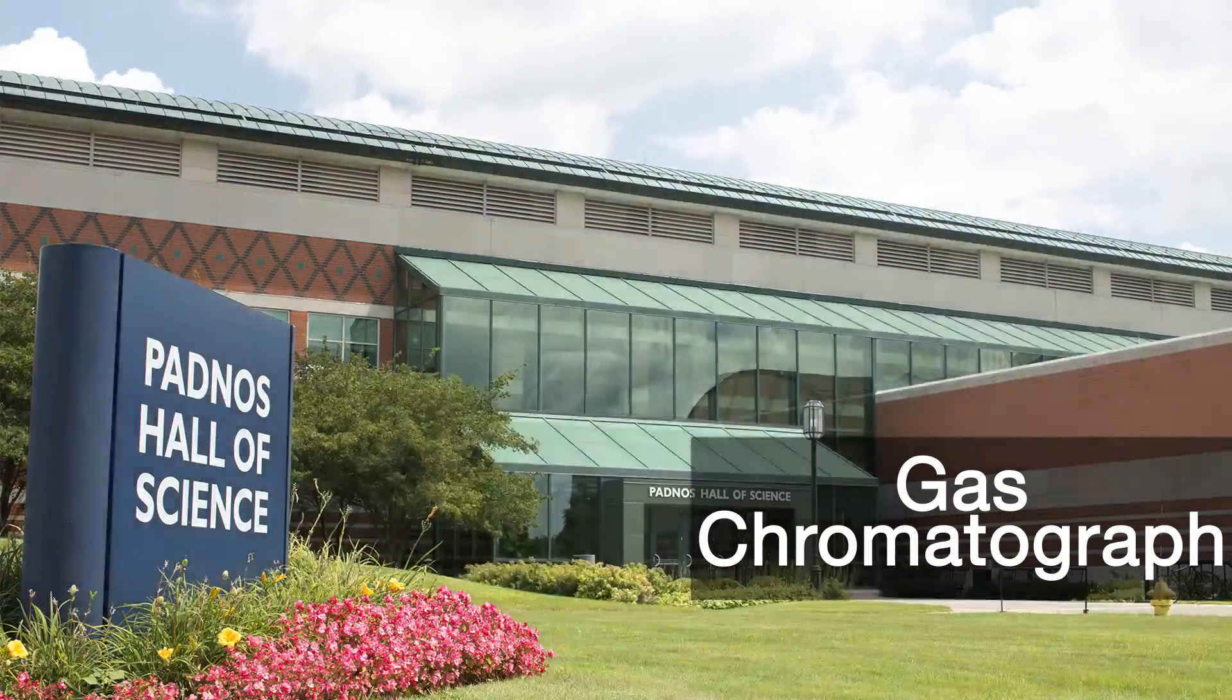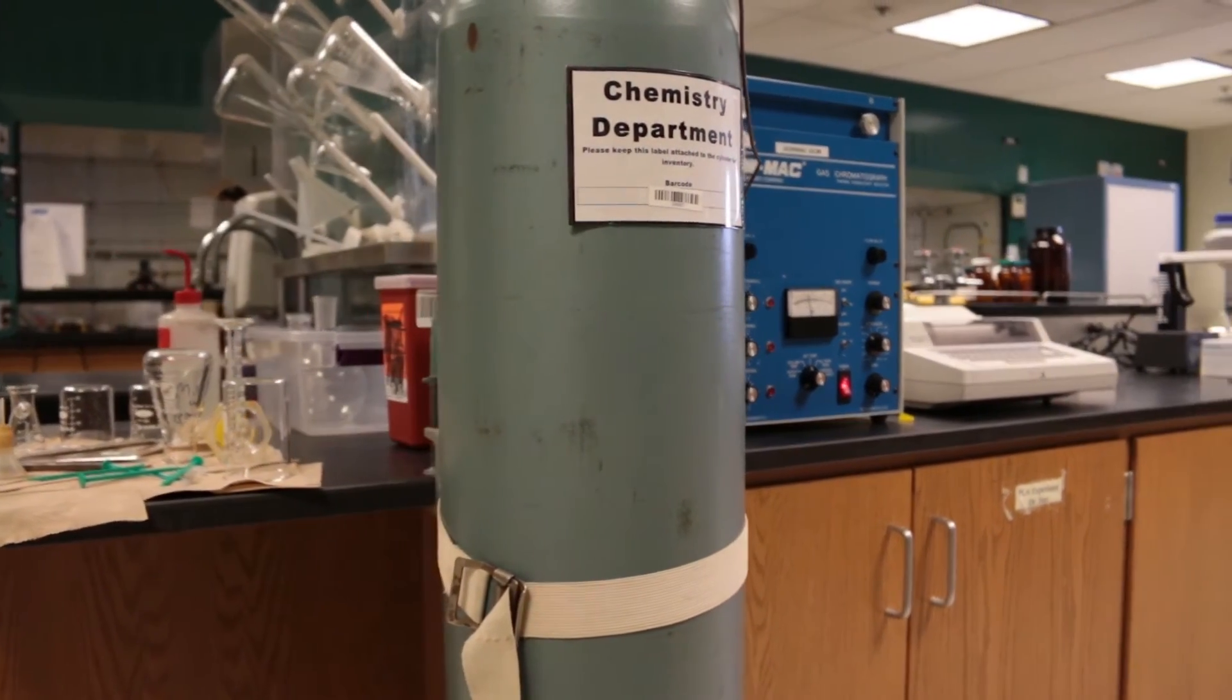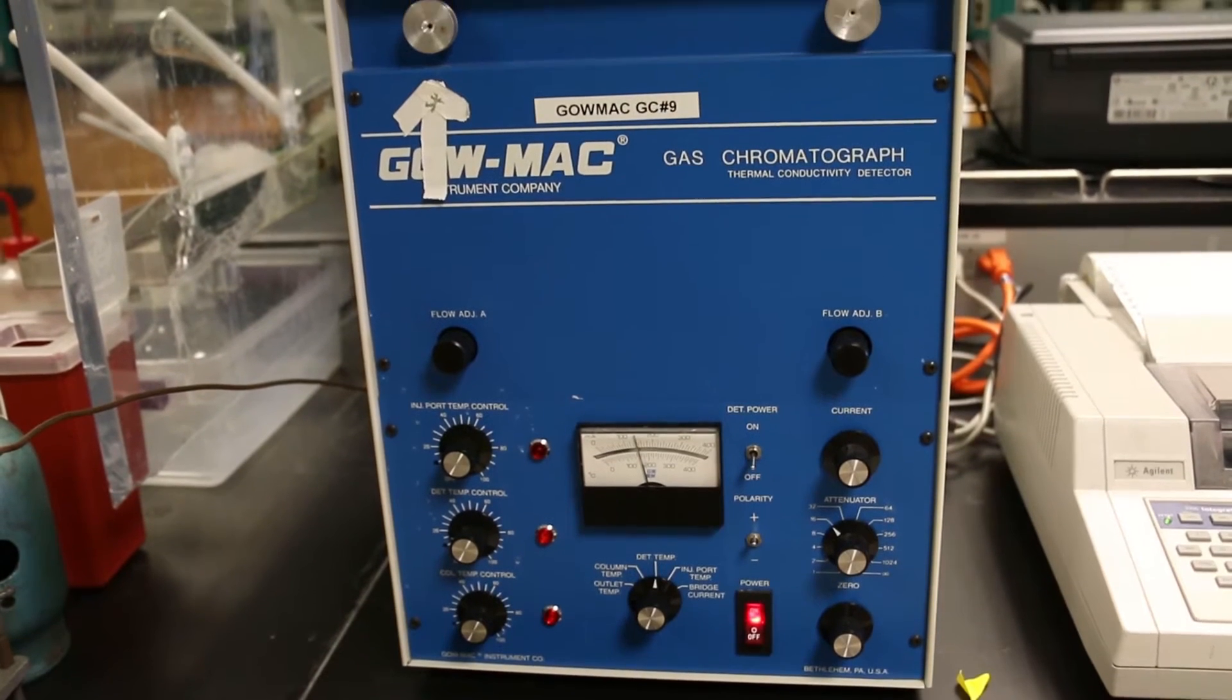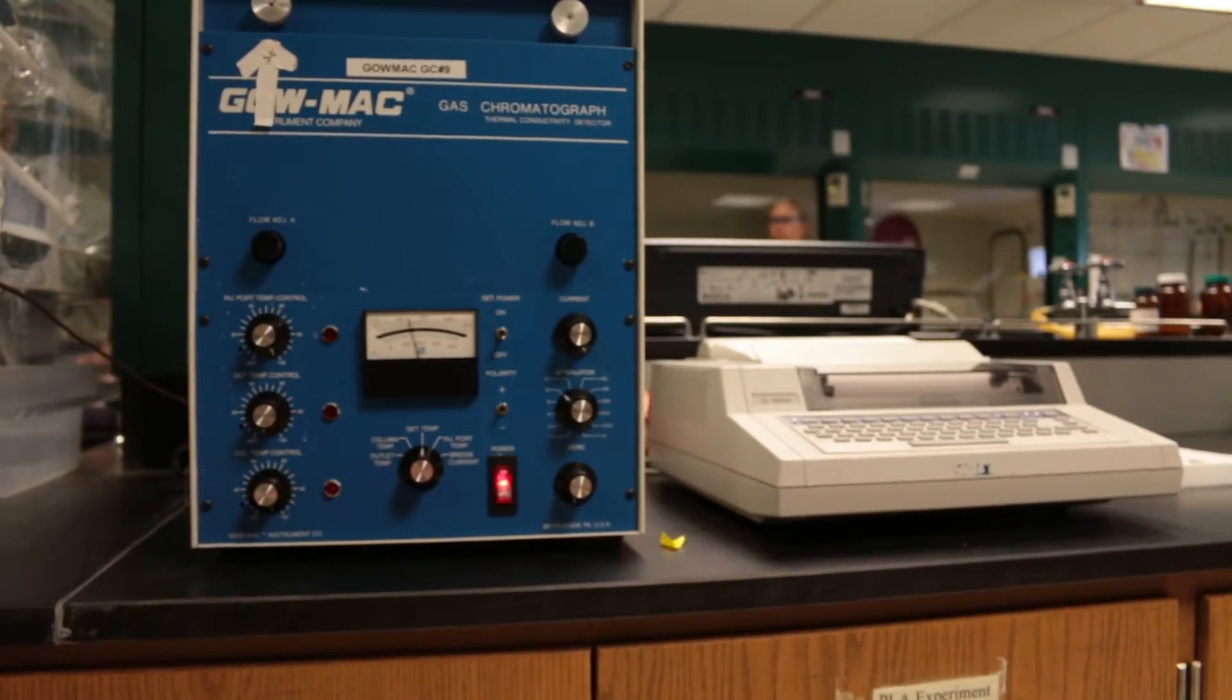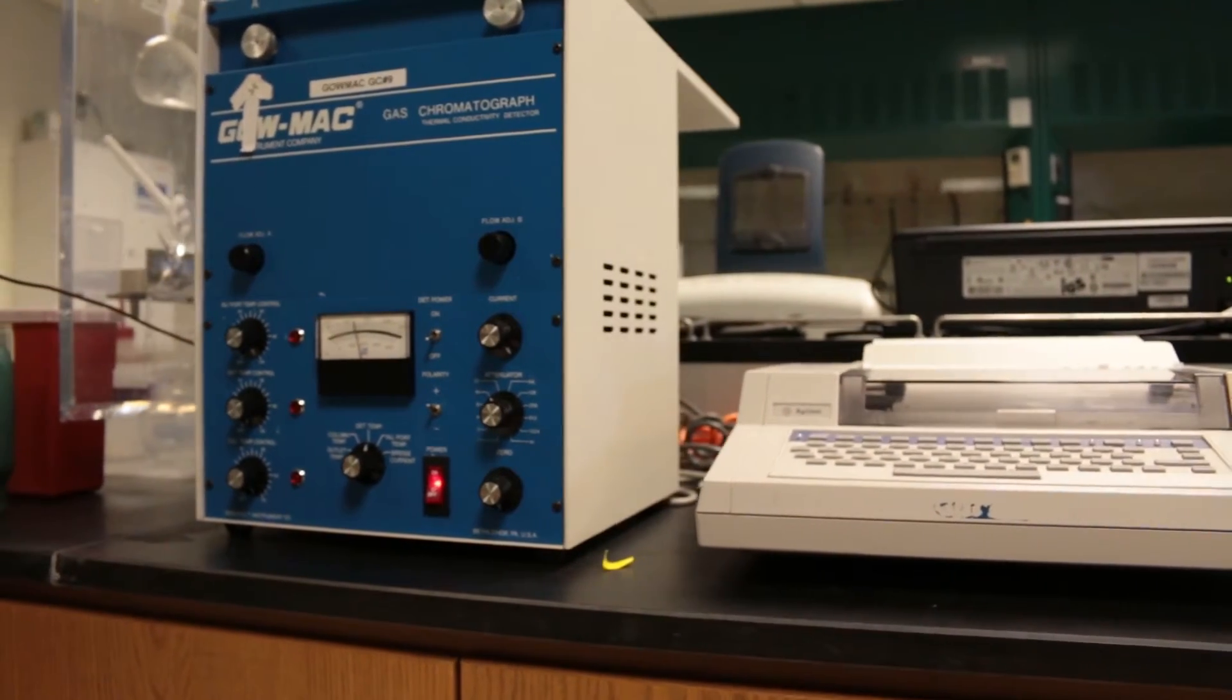The gas chromatograph is used to separate and quantify mixtures of volatile compounds in the organic laboratory. The gas chromatographs, or GCs, in the organic lab are made by the Gowmac company. Each instrument is attached to an integrator that records and quantifies output from the machines.